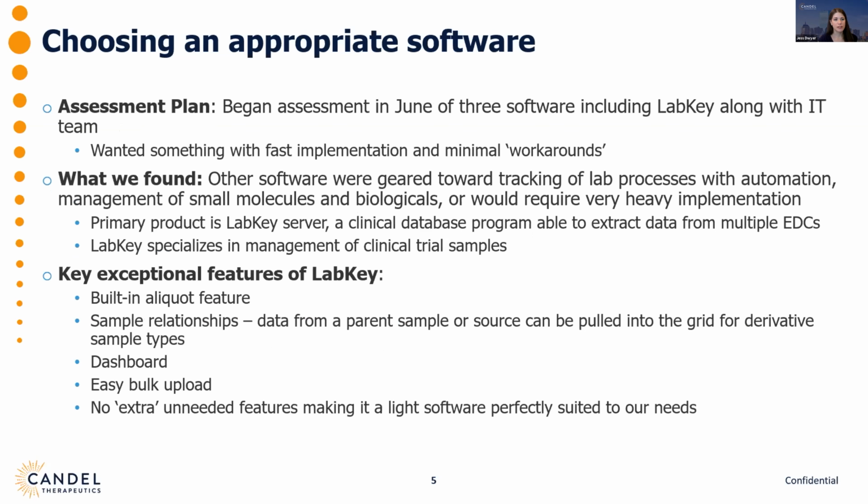So in June, I started my search for a suitable product, and we were looking for something that could provide, of course, an audit trail for any sample manipulations by different users and would be searchable by anyone who had access to the software. We also wanted to minimize the implementation time, and we didn't want to have to rely on workarounds or customization for too many of our core needs.